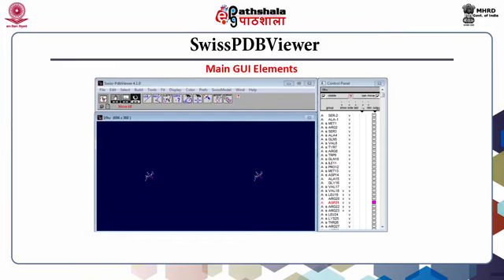This will move only selected residues. For example, when you are moving the molecule or rotating the molecule using translation and rotation commands. However, click toggle button again to move all residues for the time now.